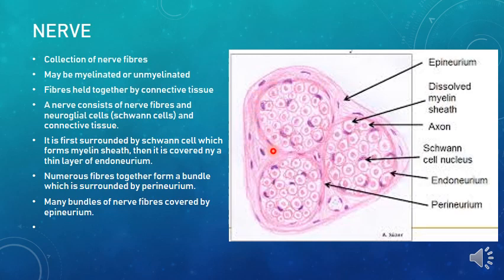The perineurium is semi-permeable and resembles more like an epitheloid tissue when compared to the epineurium and endoneurium. This is one bundle of nerve fibers, and this is another bundle. Many bundles together are covered by the epineurium.